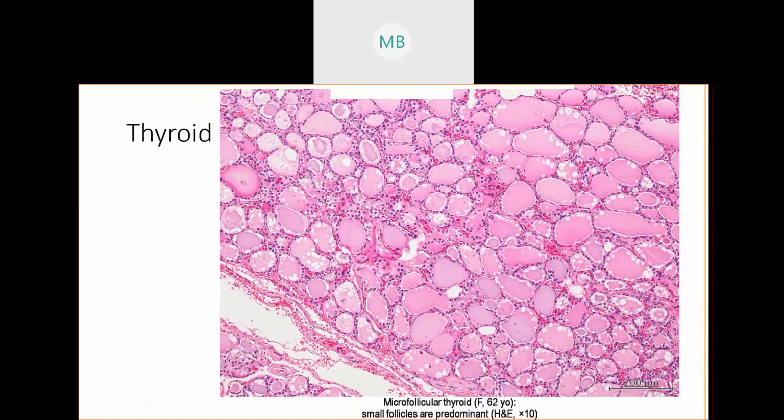We're moving on to your next picture, or your next gland. Your next gland is also a pretty easy gimme as far as microscope slides go. If you didn't know what this was and you couldn't see that I have labeled this as your thyroid, and you're just looking at this weird mess of a pink picture, it looks like dish soap. It looks like the soap that you use when you're doing the dishes.